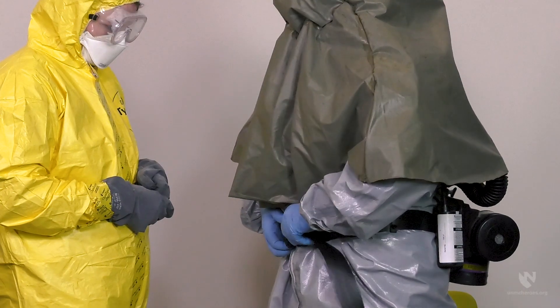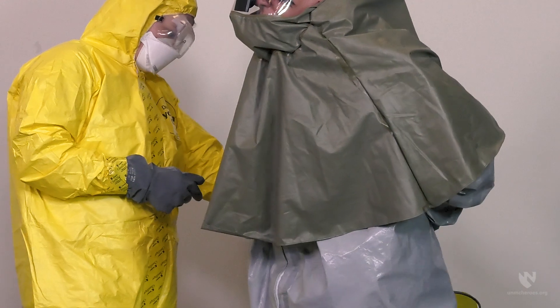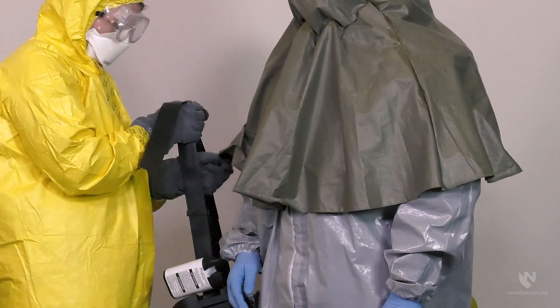Next, remove the belt ensuring the hood stays on. While the remaining items of the PPE are removed, the PAPR unit can either be placed on a chair or similar surface, or can be carried by the doffing partner until the hood is ready to be removed.